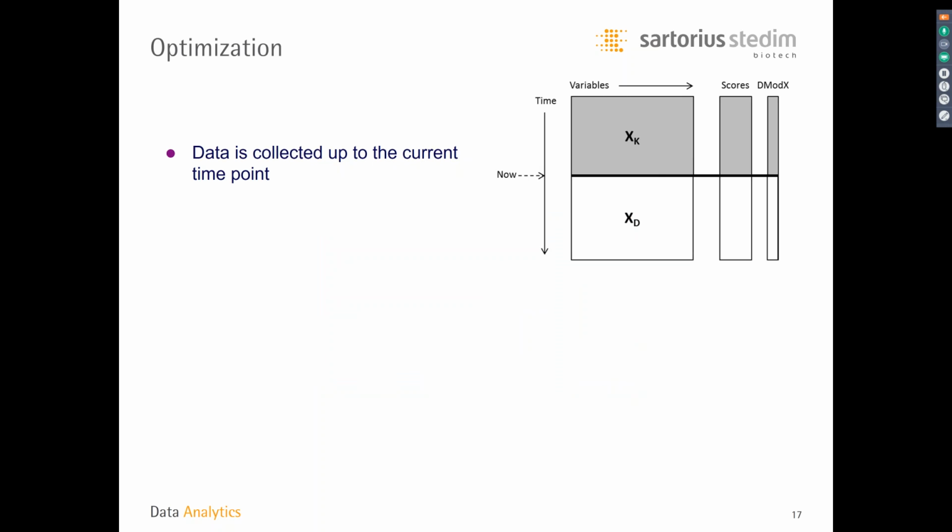The way this works is, let's say we have a batch type process. Although all my examples here are batch, we also support continuous, and the same analogies can be used. The difference in a continuous process is that a moving window is used, but you still have history, and the history is used to predict the future. At a new time point, the whole matrix of data shifts with time. Whereas in a batch, the longer the batch goes, the more of the known part of the batch is filled in. There's a fixed start and end time for batches.